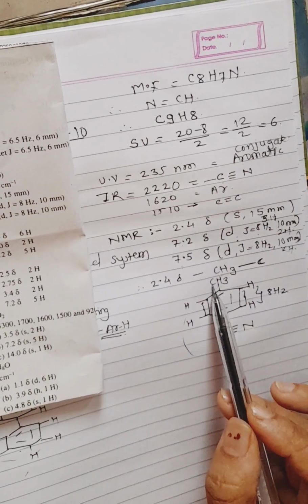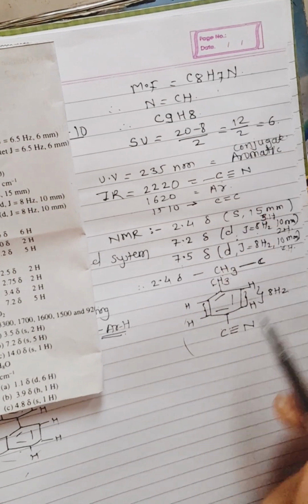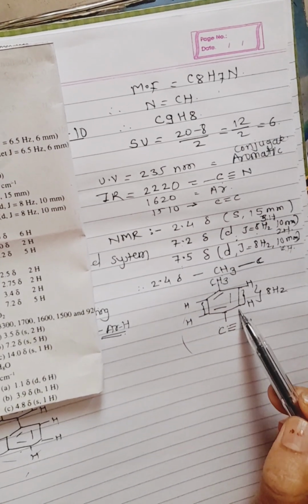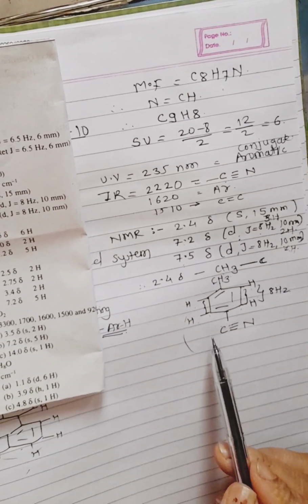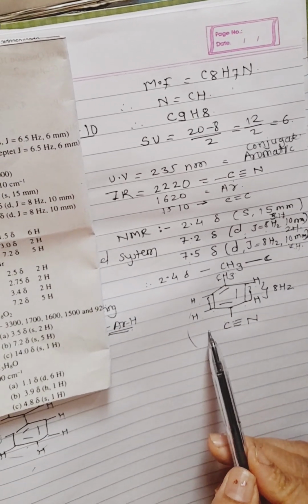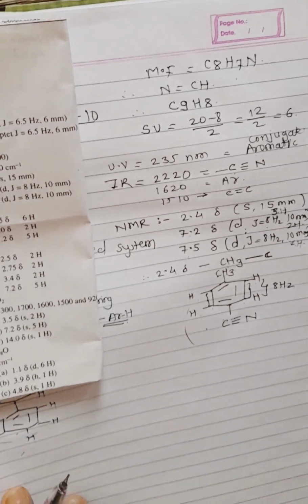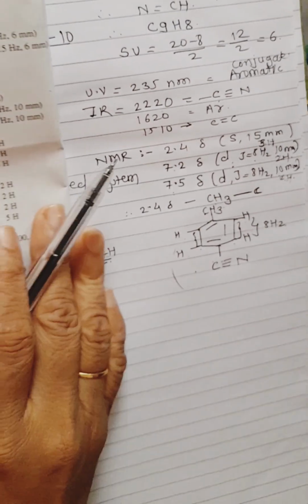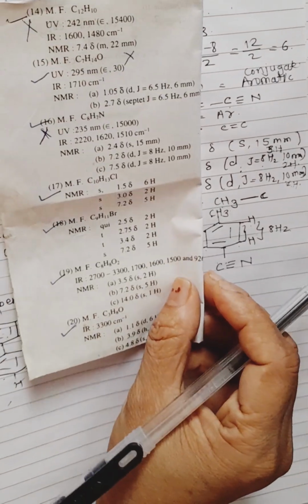You just count the number of carbon atoms, that is 8, and the number of hydrogen atoms, that is 7. The coupling constant also matches, and the IR data also matches, whatever structure we had to find out here. So friends, this is the second NMR problem which we have solved. Now we proceed toward the third NMR problem.